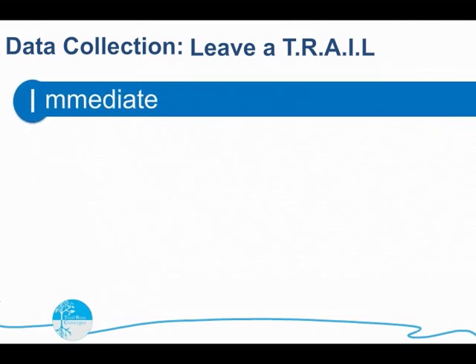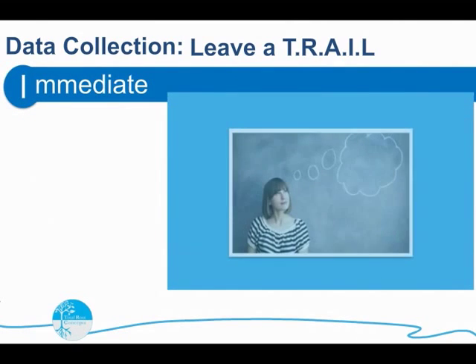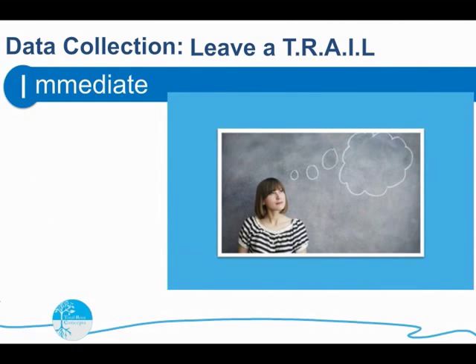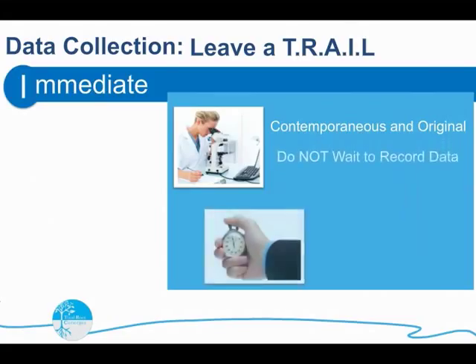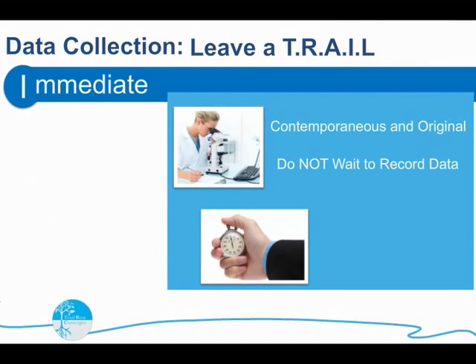Do you remember what you ate yesterday? How about last Wednesday? We can't always remember what we ate, what we wore, or little details. How do we expect to remember a solution volume or observation days or weeks later? All data should be recorded as soon as possible in a notebook or on approved form. Waiting just introduces chances to record the wrong thing or to forget altogether.